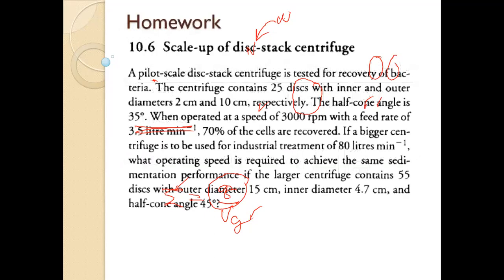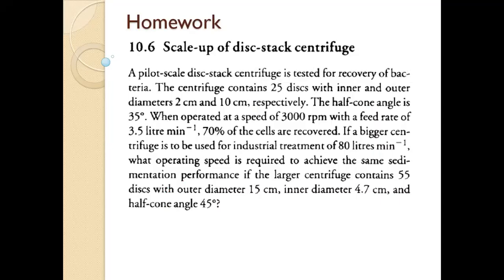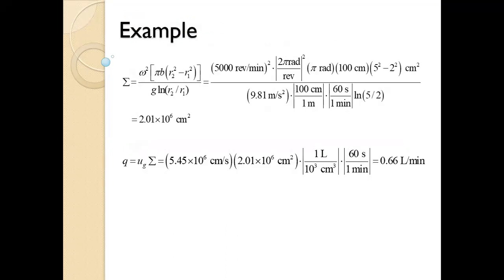We can also use this for scale-up. I will give you a homework on scale-up. In this case, you use the data from the lab scale to estimate the bigger scale. It is the same technique that I talked to you about in filtration.